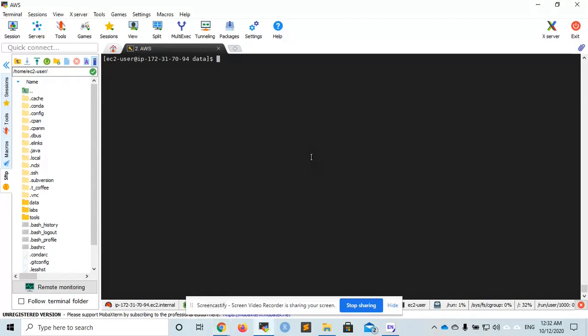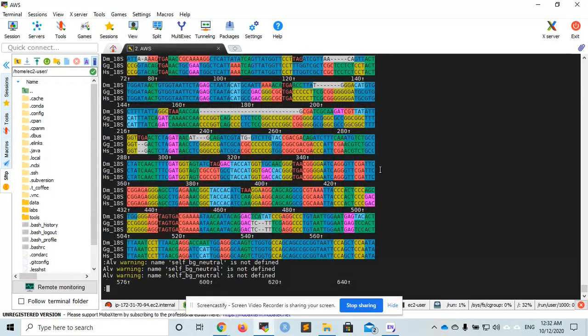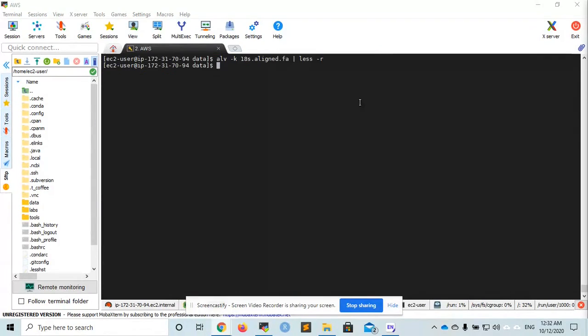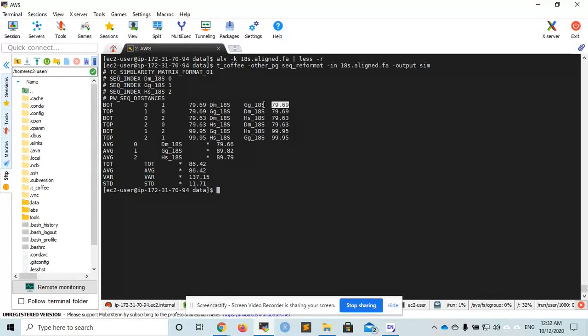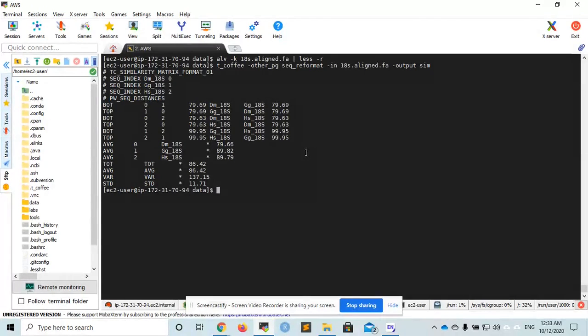We can visualize the alignment using the program ALV, and we can quantify the alignment by using T-coffee. Here, you can see that the difference in percent identity between Drosophila melanogaster and Gorilla is 79%, while the difference between Homo sapiens and Gorilla is 99.95%.